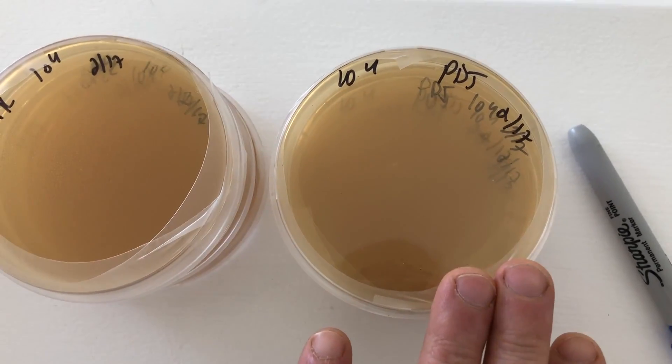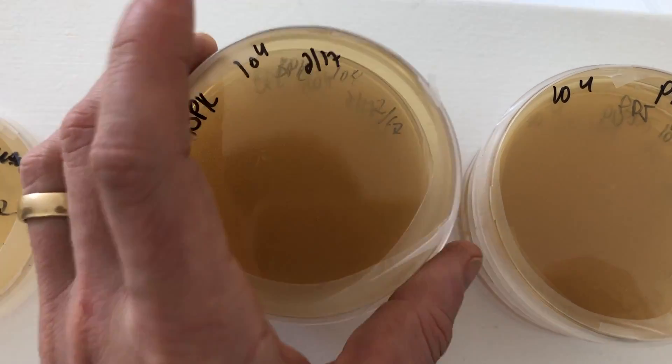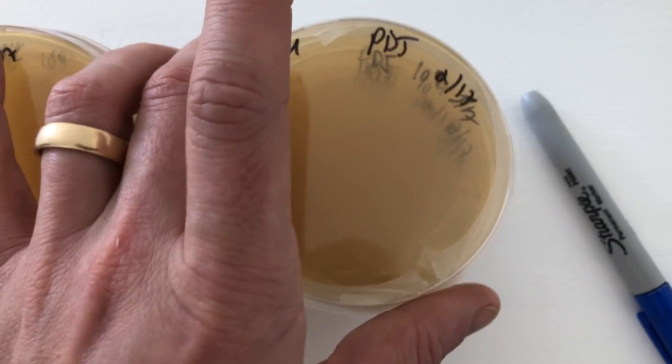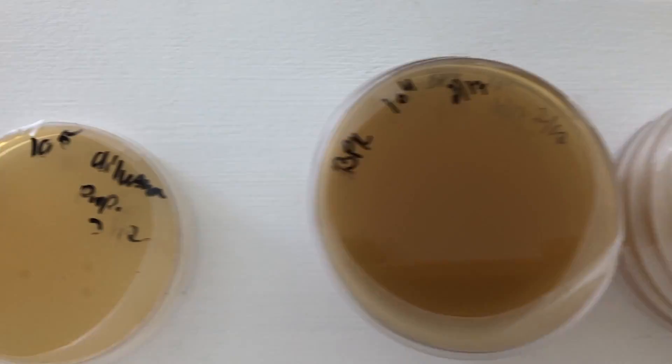I've got my pink oysters at 10 to the 4th, black pearl kings at 10 to the 4th. These are all looking really clean, no signs of contamination, so those ones I'm really hopeful for.